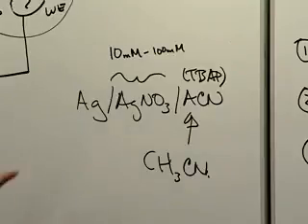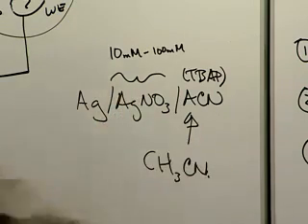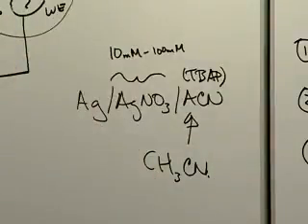So it has to be checked, say, at least once a week. And it's very simple to check it. Just take a voltmeter, take your SCE, which you have, put the voltmeter between the reference and the SCE, the silver and the SCE, and make sure you know what your reference is versus SCE. And then you can go off and do whatever experiment you're interested in.